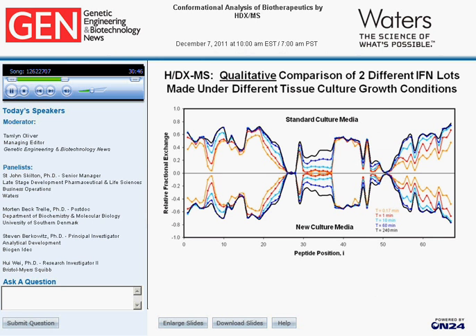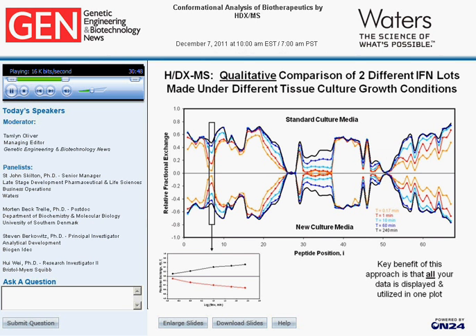And again, remembering that, as indicated here in this little rectangle in the plot, we're looking at these deuterium exchange plots for a given peptide. So we can easily see that in some cases the peptides are changing over time, whereas others, they don't change at all. In some cases, they change, but after they very rapidly change, we see no further change in the deuterium exchange uptake.